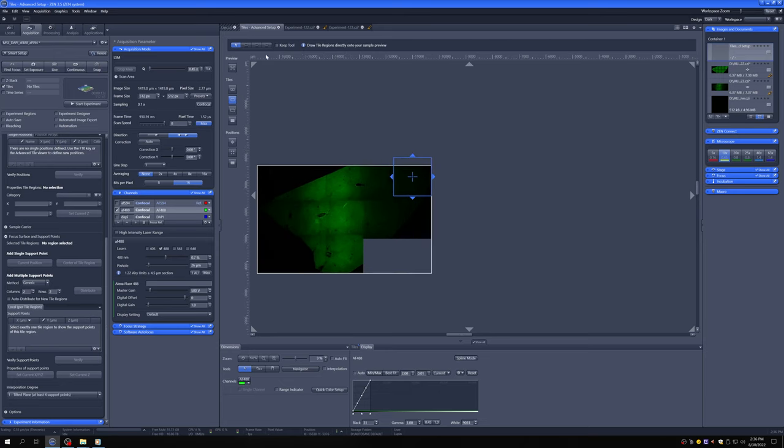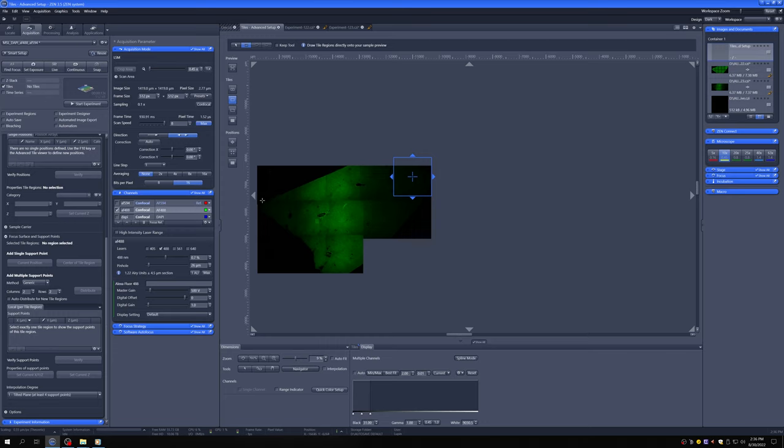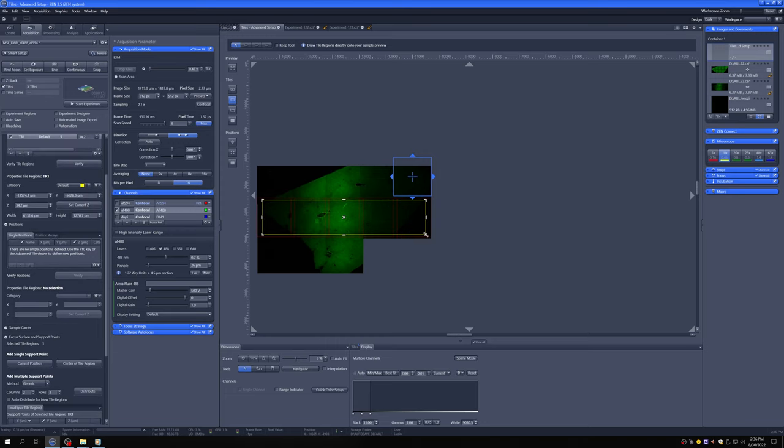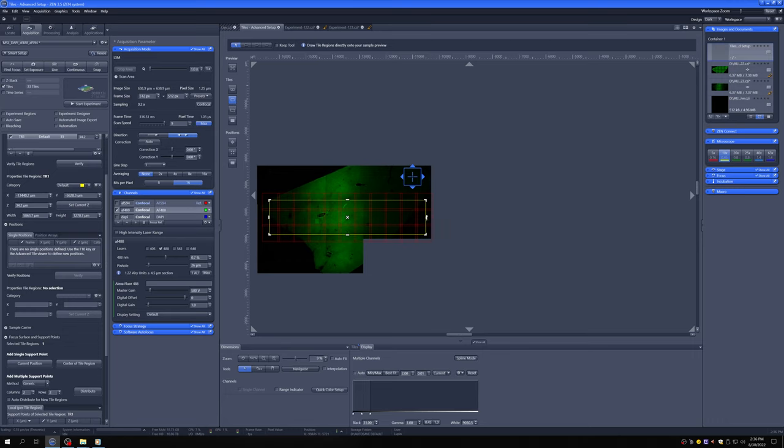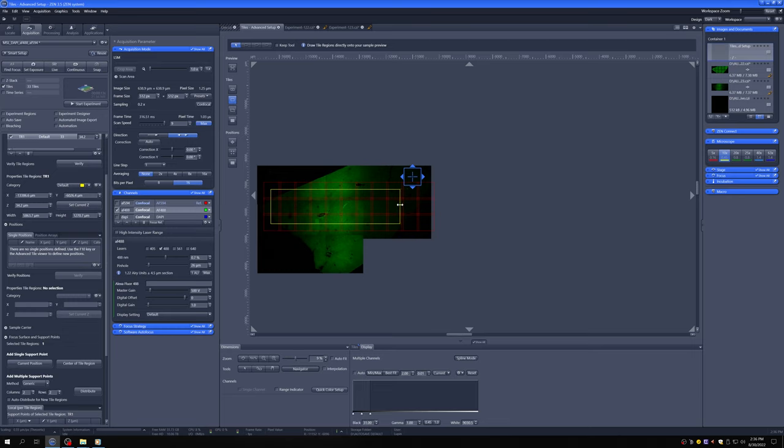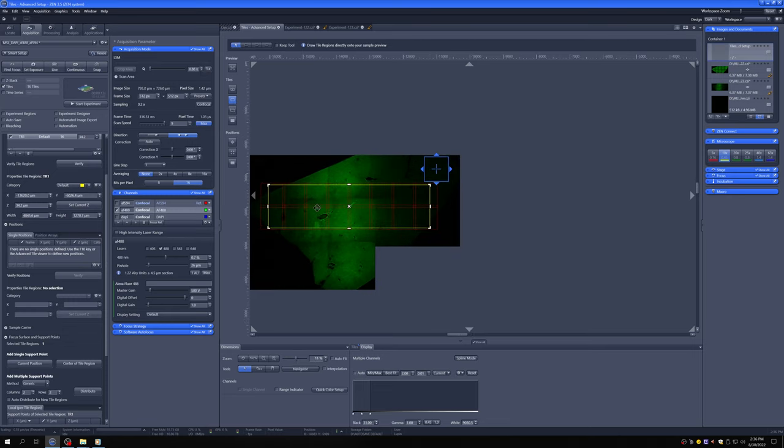So let's go ahead and do that. I'm in the viewer, I'm going to create just a tile like this. I'm going to go to kind of 1x here, maybe something like that. Actually, let me reduce it a little bit so it's a little bit faster. So something like this. Okay, so I'm going to create that.